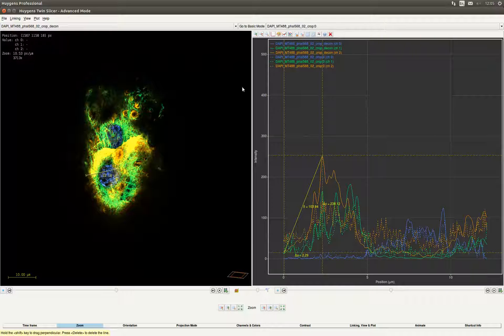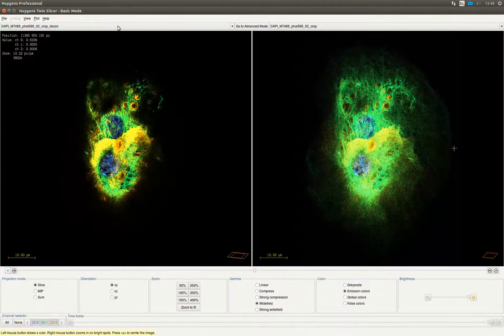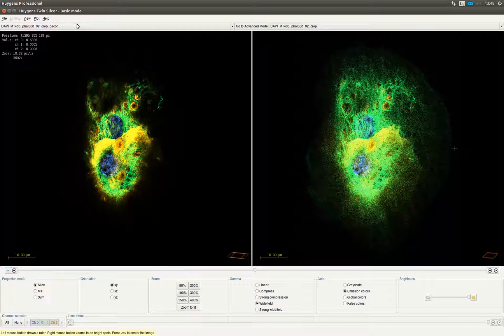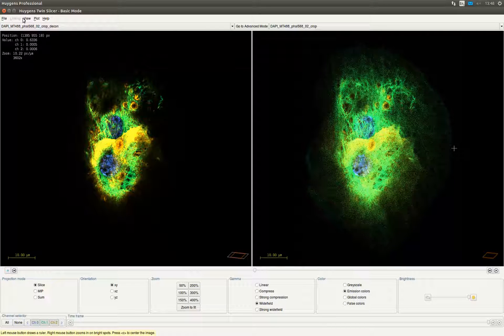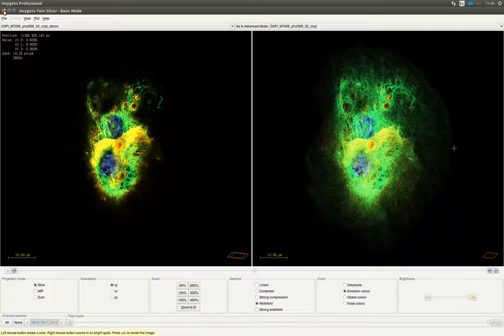There is also a basic mode available of the twin slicer besides the advanced mode we are using right now. In this mode you can use all the basic functions from the twin slicer and you do not need a license for it. It is free to use. We now close the twin slicer.